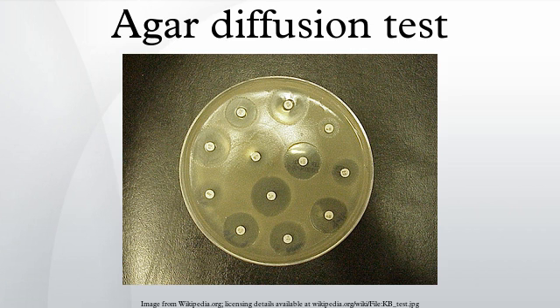Use an antibiotic disc dispenser to dispense discs containing specific antibiotics onto the plate. Using flame-sterilized forceps, gently press each disc to the agar to ensure that the disc is attached to the agar. Plates should be incubated overnight at an incubation temperature of 37 degrees Celsius.